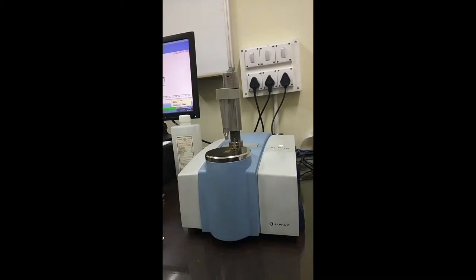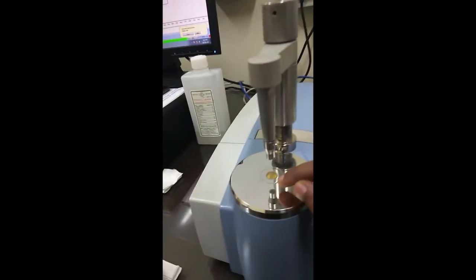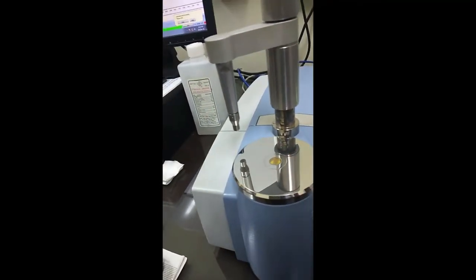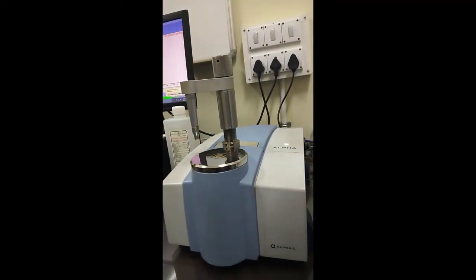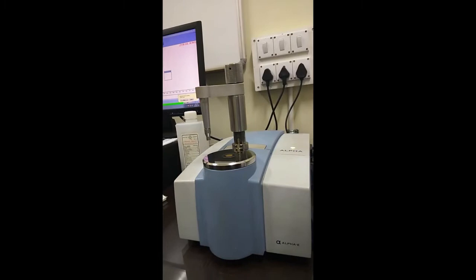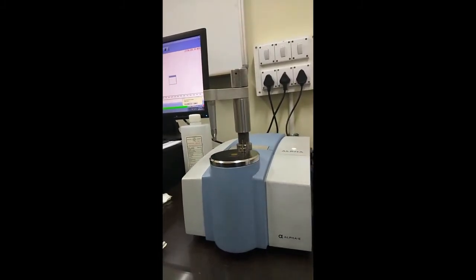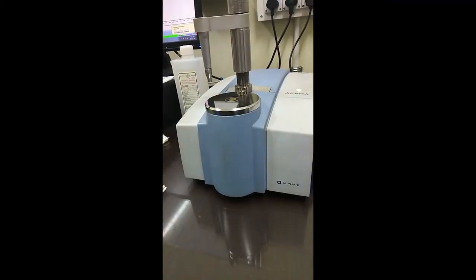The instrument majorly consists of an ATR crystal, which is placed here. Now this ATR crystal in this system is made up of zinc selenide. This ATR crystal is designed in such a way that it should have a higher refractive index than the sample.